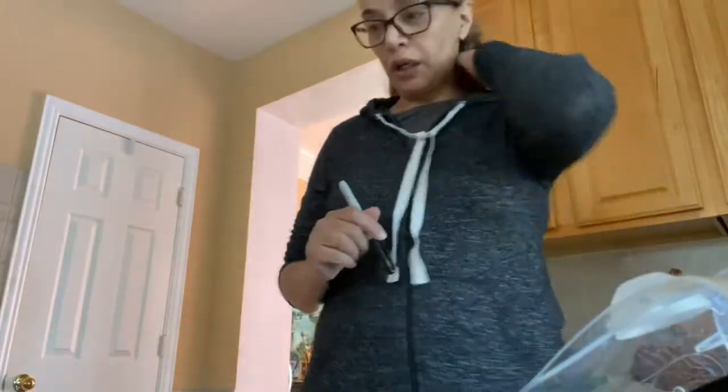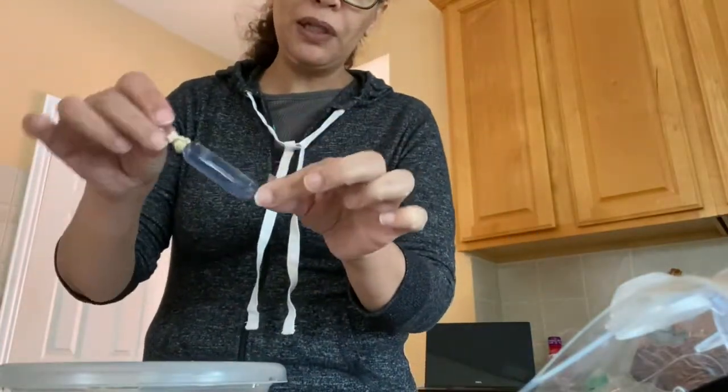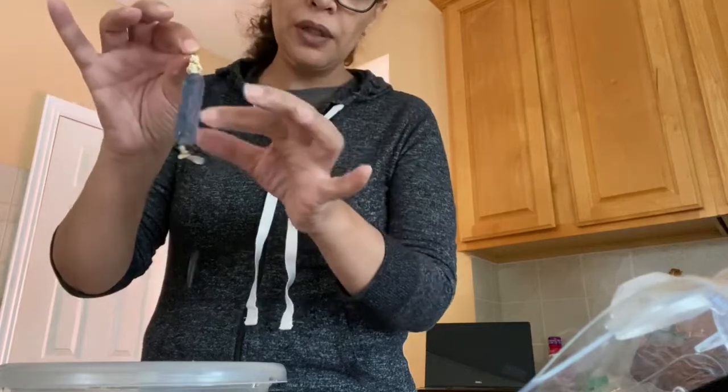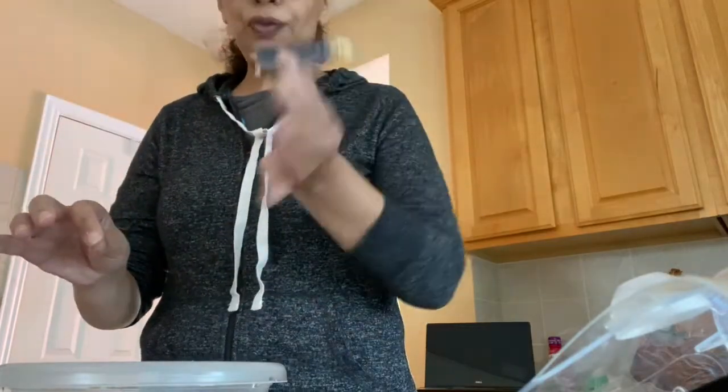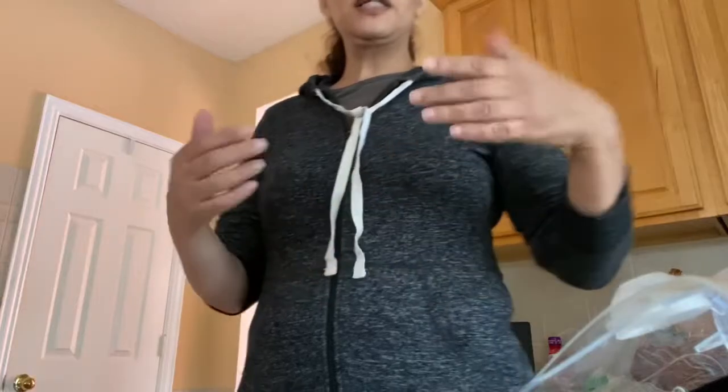All right, guys. We looked already at the artificial dialysis or diffusion of iodine inside of the starch solution. Did you see that the starch solution turned completely dark blue? All right. Look at that. Now we are using the same dialysis membrane, the same artificial membrane, to study the osmosis. And those membranes, we know, let the water get in, small molecules get in and out, but not big molecules such as the starch.